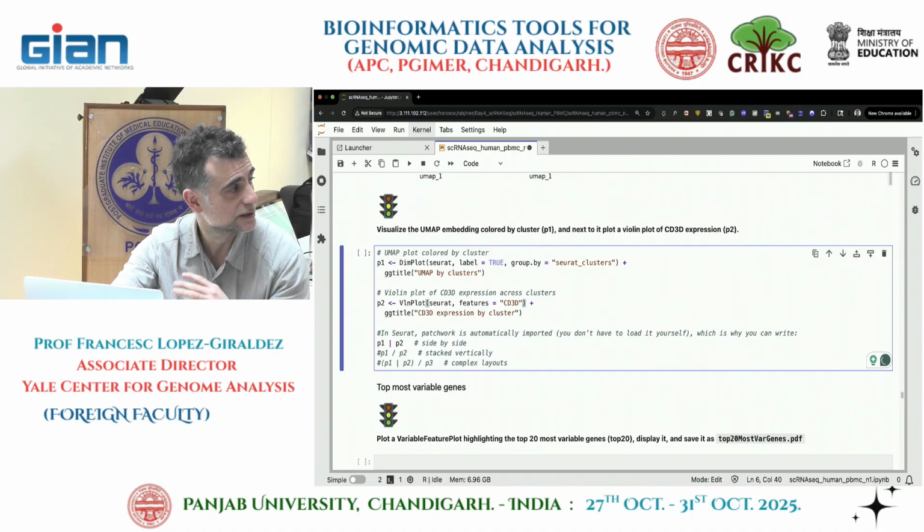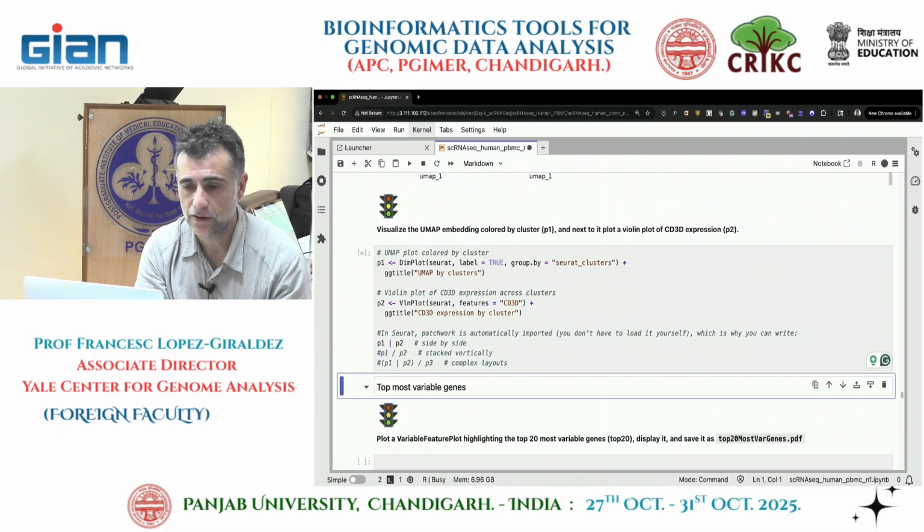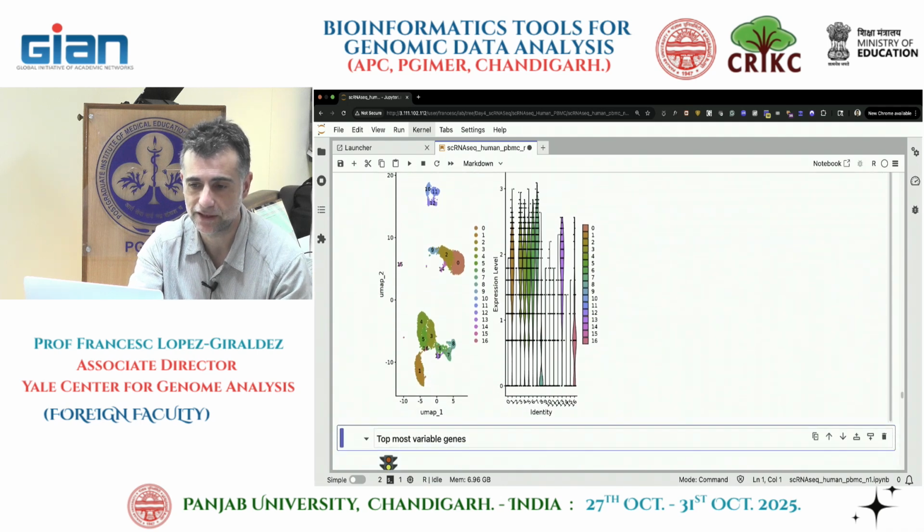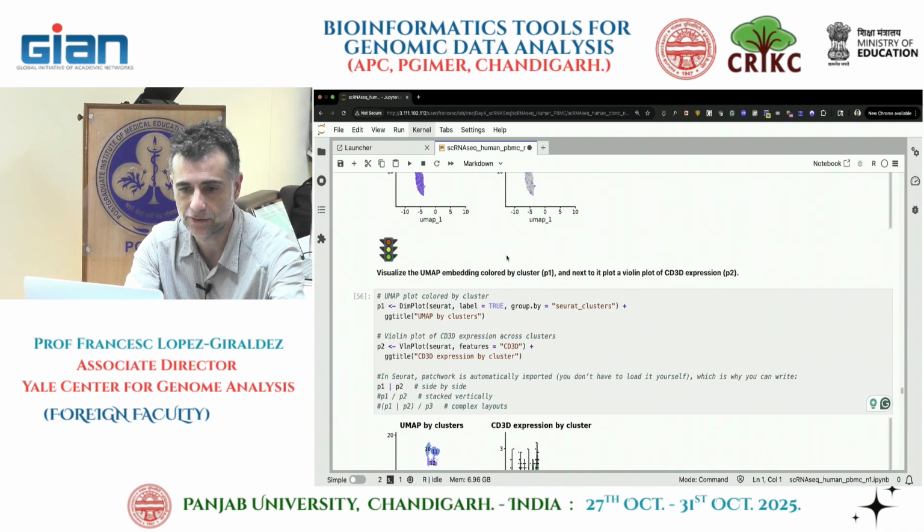Did anybody reach at least this point or something similar? Yes. Yep. So if we try to plot this, it's not exactly what I'm asking. Oh, well, it works because you still have the identities. Oh, sorry, it looks very ugly now.